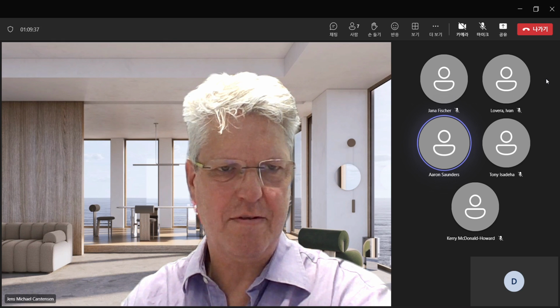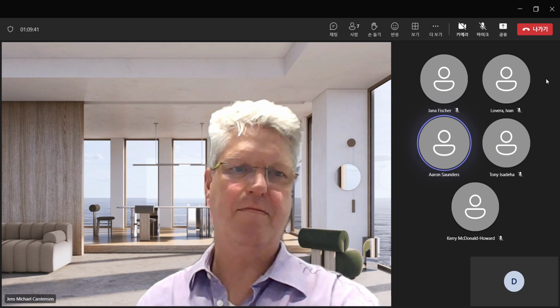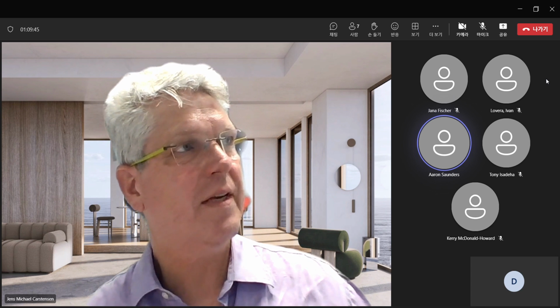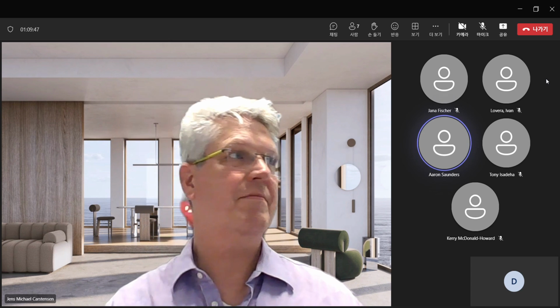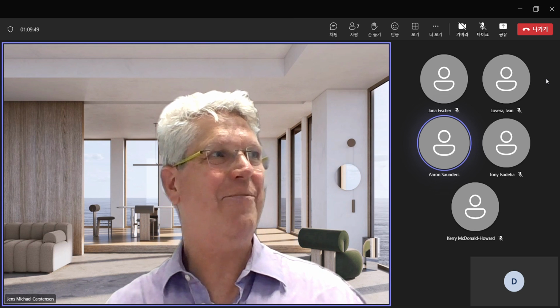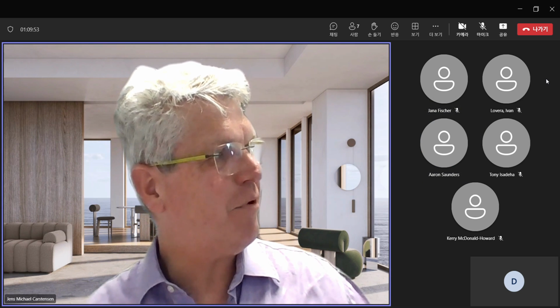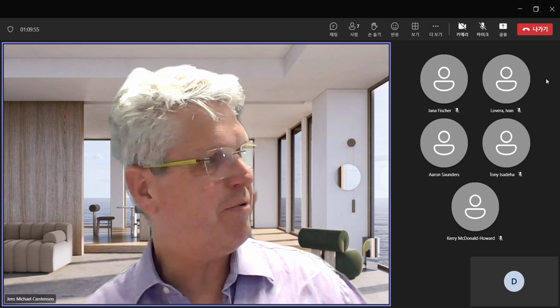Do you have examples of other things that your customers can measure? I mean, you can measure anything, I guess. Yes, we can measure anything.